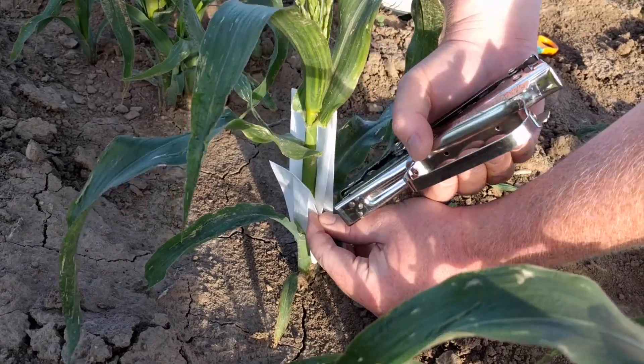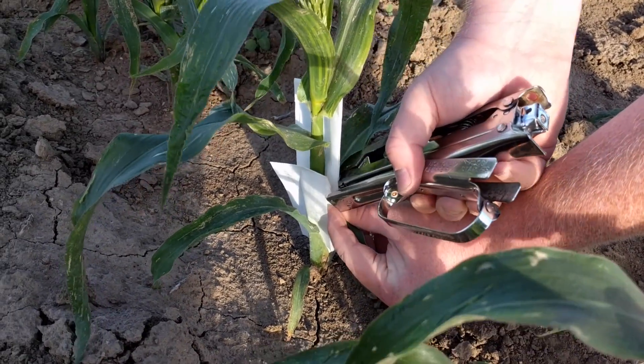Alternatively, the lower earshoot can be bagged as well, and the two shoot bags can be stapled together.